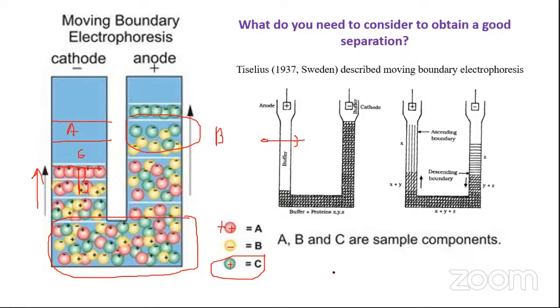Say, if I draw cathode over here and anode over here, just for simplicity's sake, instead of the U-tube arrangement, when all the molecules are at the center and now they are trying to migrate from here to other poles, during the process they are going to pass through each other, right? So in that process, they will be creating a large degree of friction. Do you agree? There will be a large amount of friction when they are going to move.